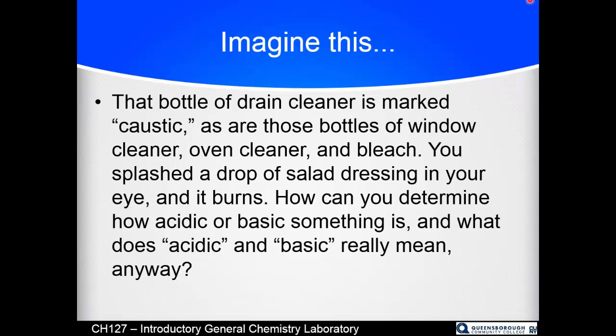But you do want to be careful with acids and bases, and you want to be more careful, of course, the more strongly or more concentrated the acid or the base is. So in this lab, we will measure some different concentration acids and bases and measure them via different methods.